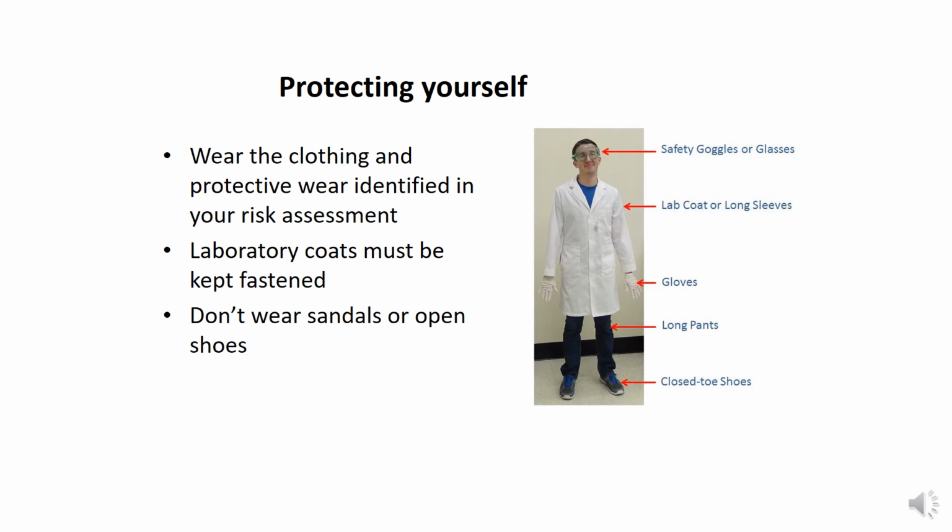It is really important to cover different parts of your body while working in different experiments. For example, you see the glasses. Although this is not recommended every time, in certain experiments you need these glasses. For example, there are some special glasses. If you are going to visualize the DNA in the agarose gel under UV light, then of course you need to wear these glasses.